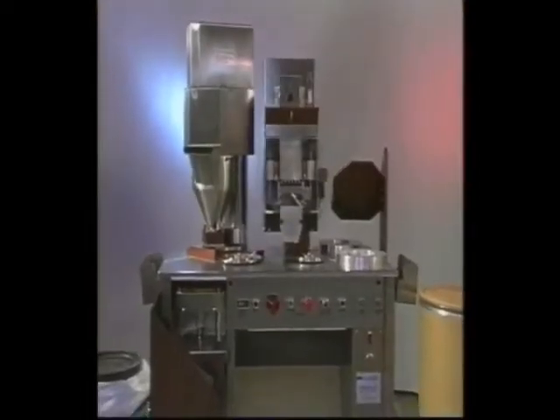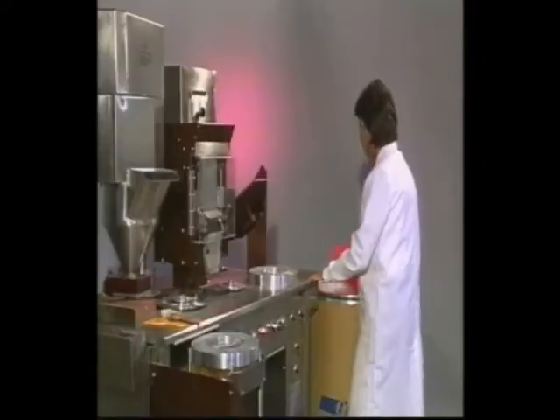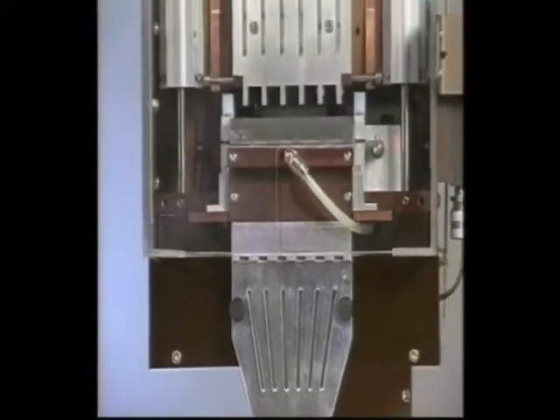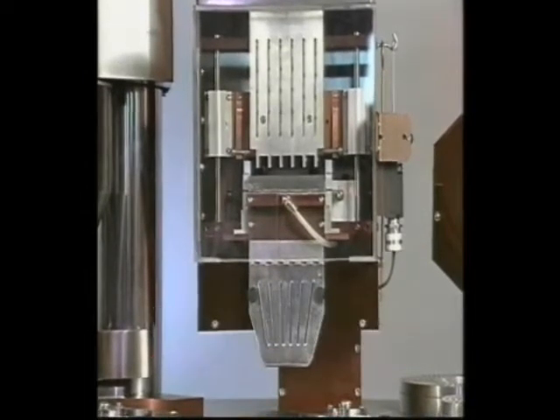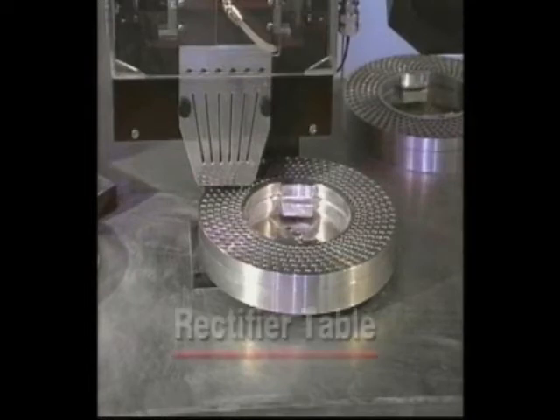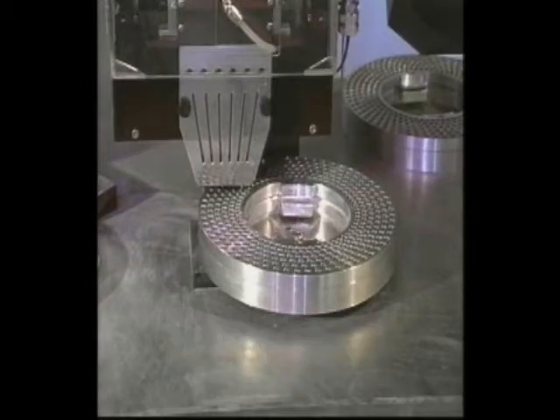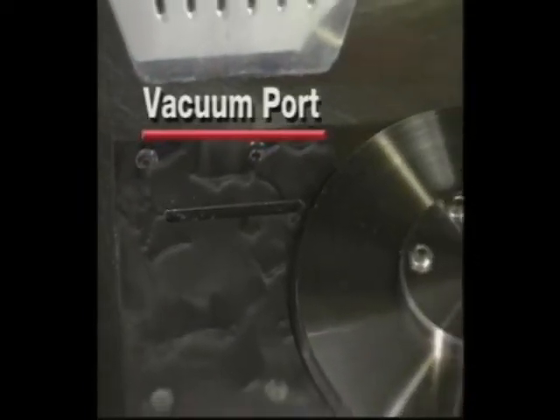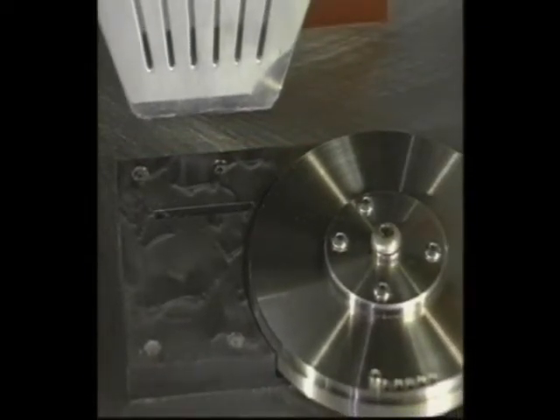The Model 10 was designed for maximum efficiency. First is the capsule hopper — you will place empty capsules into it to begin the process. The capsules feed from the hopper into the rectifier assembly, which orients the capsules correctly. A complete filling ring is placed on the rectifier table, which rotates one full revolution while being filled with empty capsules. The vacuum port is located directly under the rectifier table.